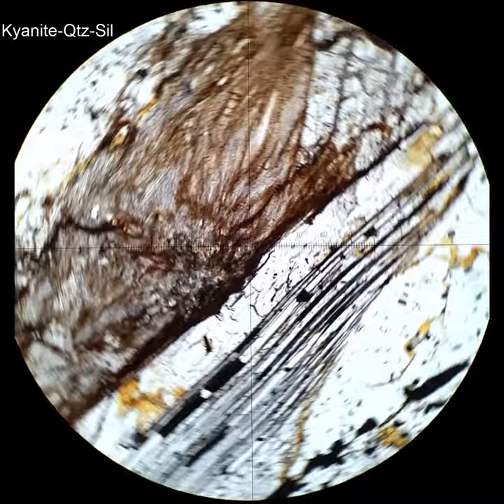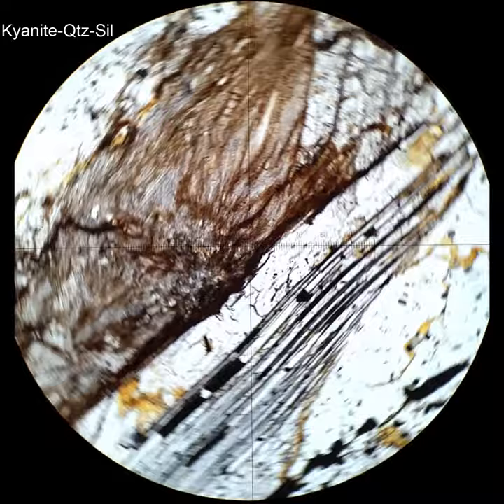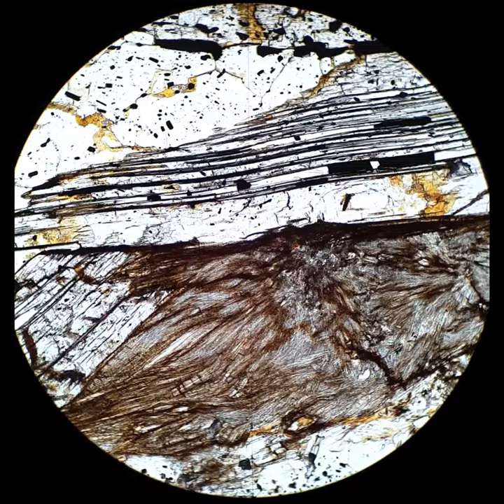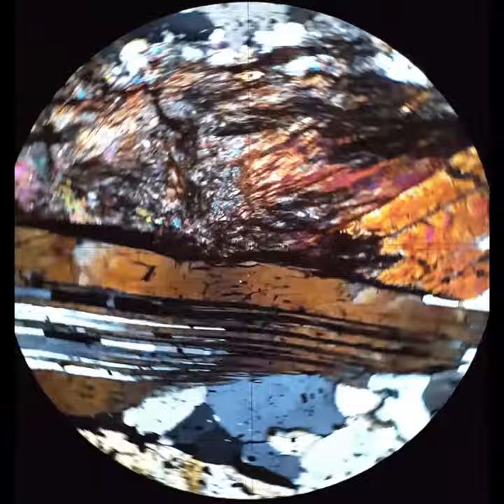This is one of the few samples I have with kyanite and sillimanite actually in contact with each other. Kyanite is the high relief mineral with good cleavage. Sillimanite is all the fuzzy stuff that's now coming to the bottom of the field of view. Across the polars you can see the kyanite has yellow-orange interference colors, and sillimanite is similar, but it has a very different texture, and that's how you can tell the difference between the two in this context.